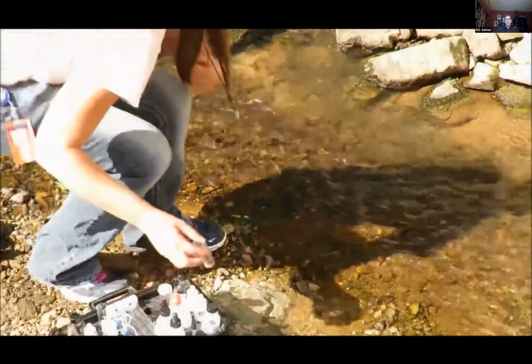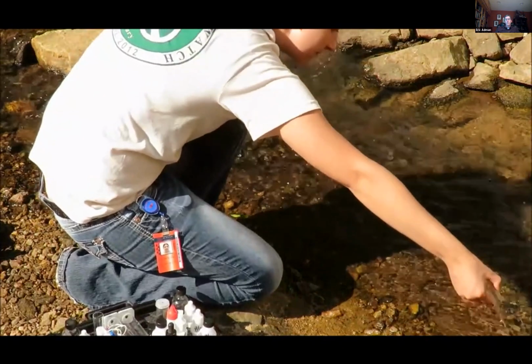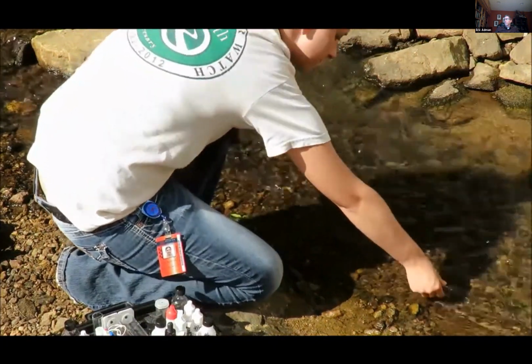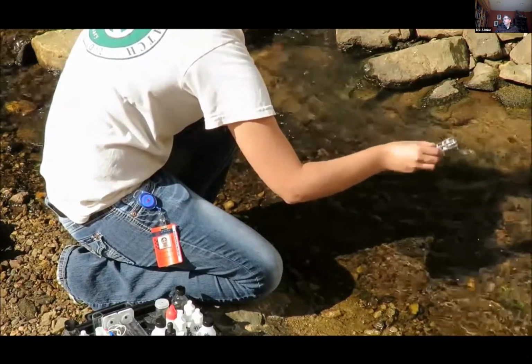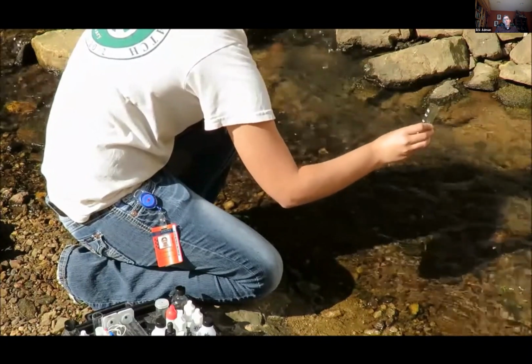Remove the alkalinity test tube from your kit. Rinse the tube 2 to 3 times with water from your site. Fill the tube above the 10 milliliter line with site water and flick out excess until the bottom of the meniscus touches the 10 milliliter line.